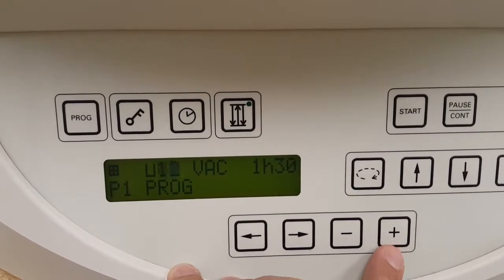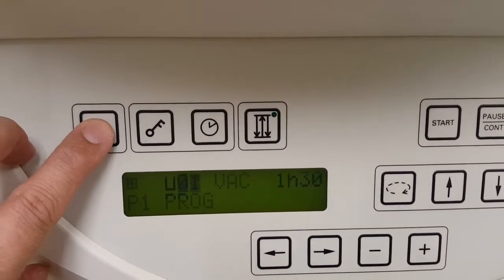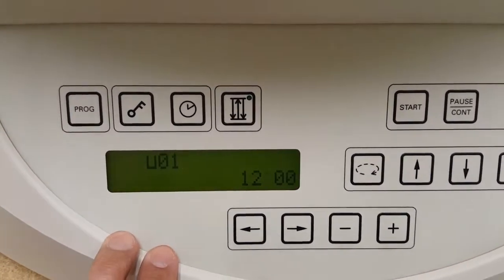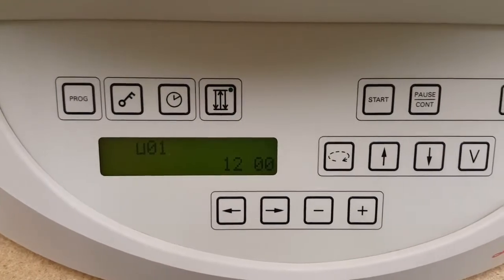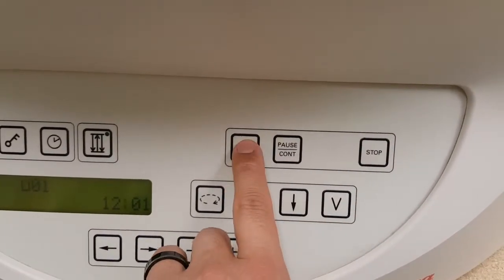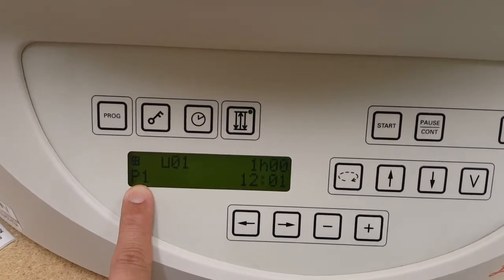After you're done, you can hit program and it has just programmed program one. Now to start that program, you come over here and press start from the home screen. It will ask you what program you want to start, so you'll start program one.